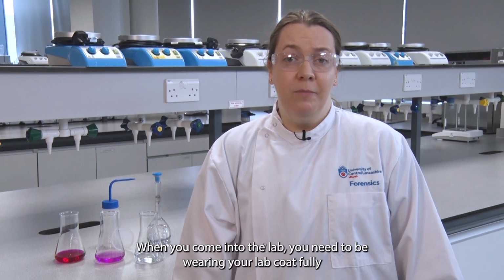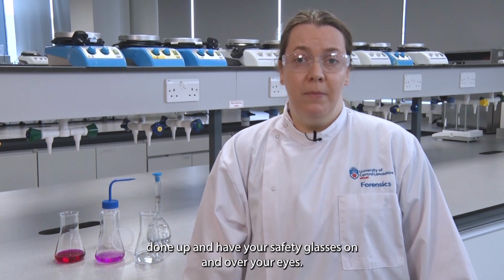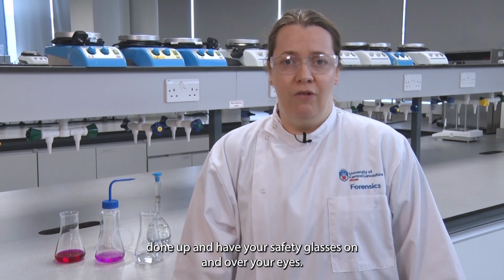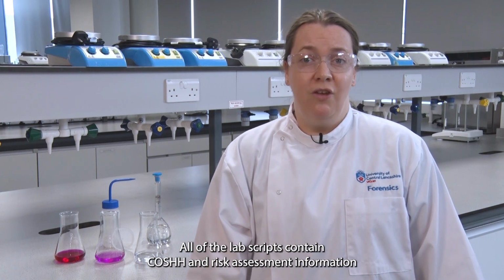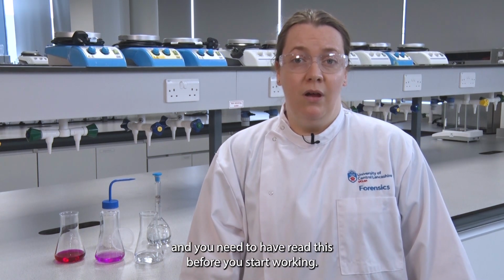When you come into the lab, you need to be wearing your lab coat fully done up and have your safety glasses on and over your eyes. All of the lab scripts contain COSHH and risk assessment information, and you need to have read this before you start working.